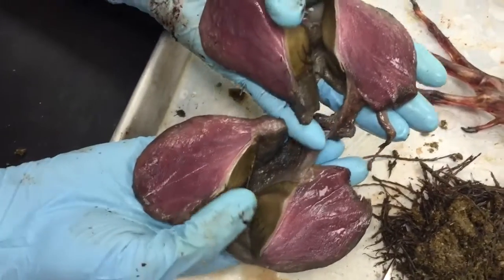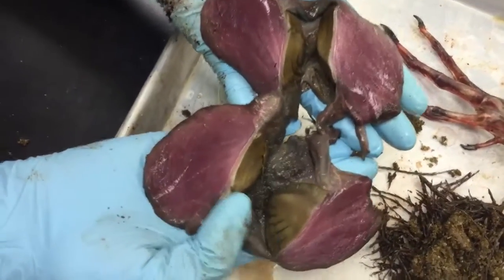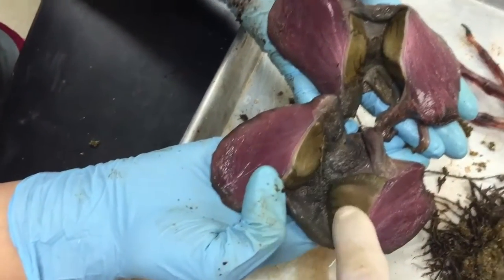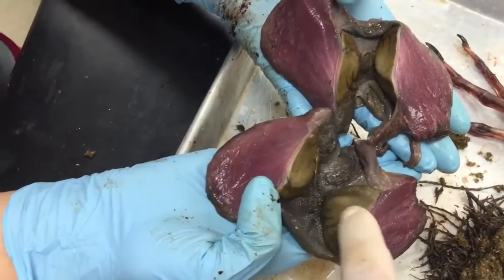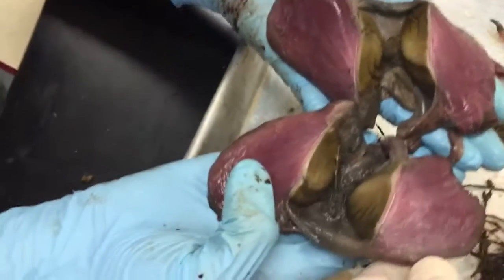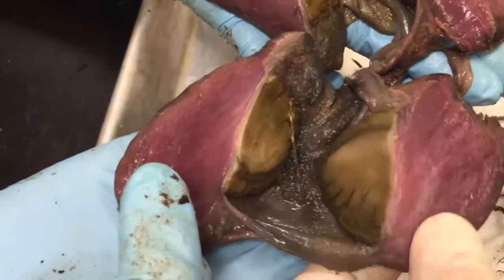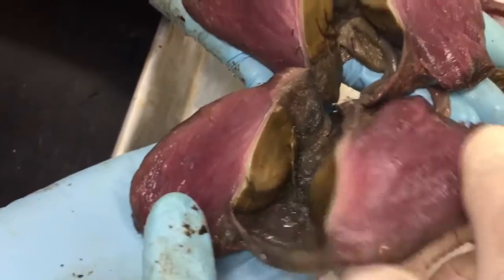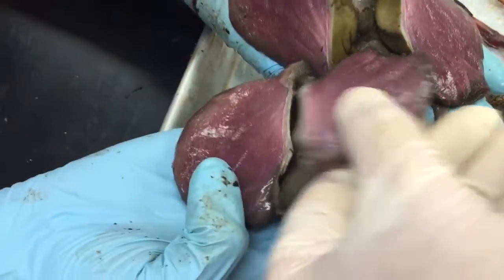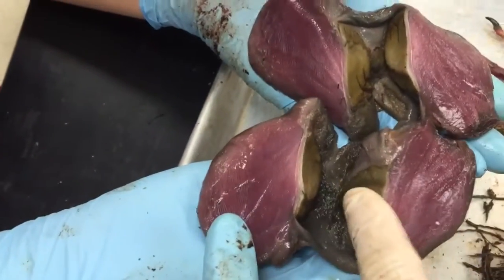There are two sets of cuticular portions — basically horny pads. This goose is chewing with its stomach. You can see the edges of these things; this is a hard horny pad right here that in a sense occludes with that other horny pad right there. They basically chew up the plant material that was in here.